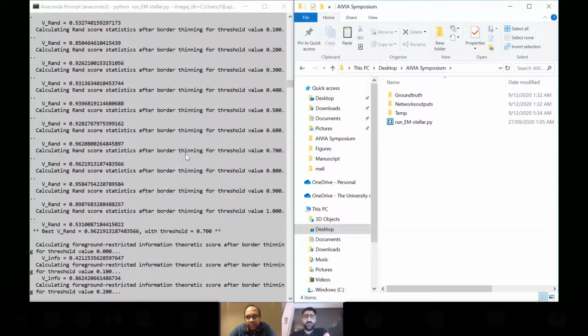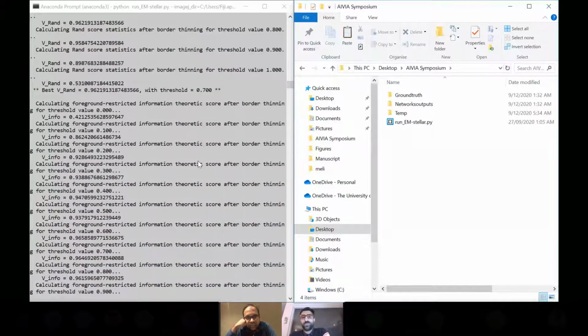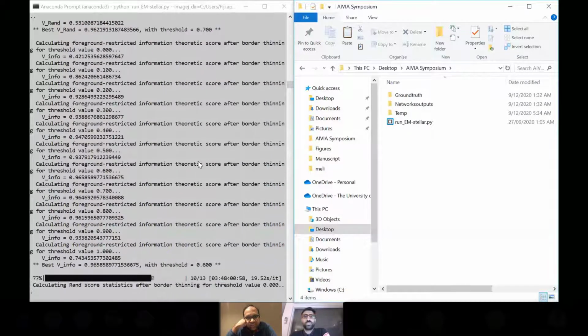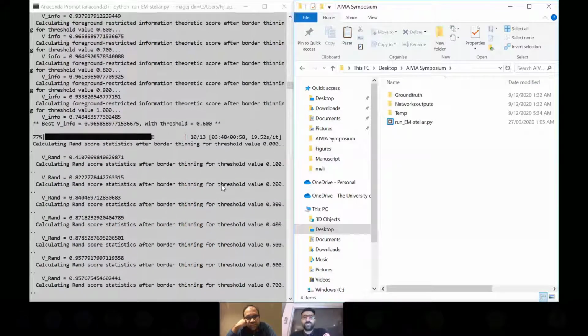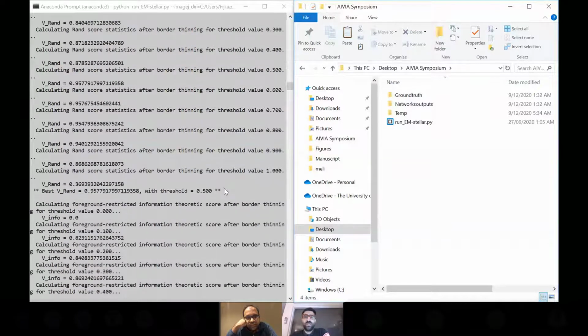And after the VRAND and VInfo are calculated, the algorithm goes through obtaining and pooling those standard metrics that I just mentioned, including F1 score and negative and positive predictive values.